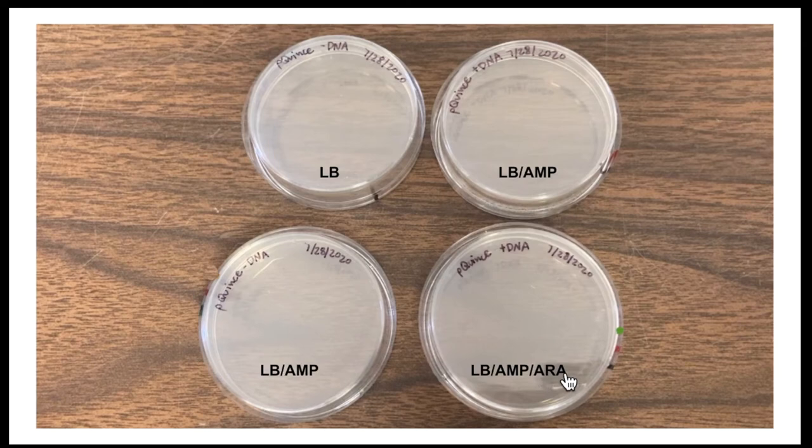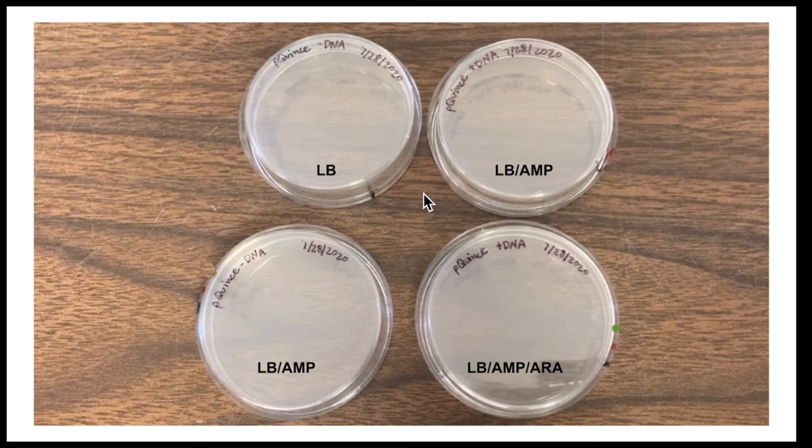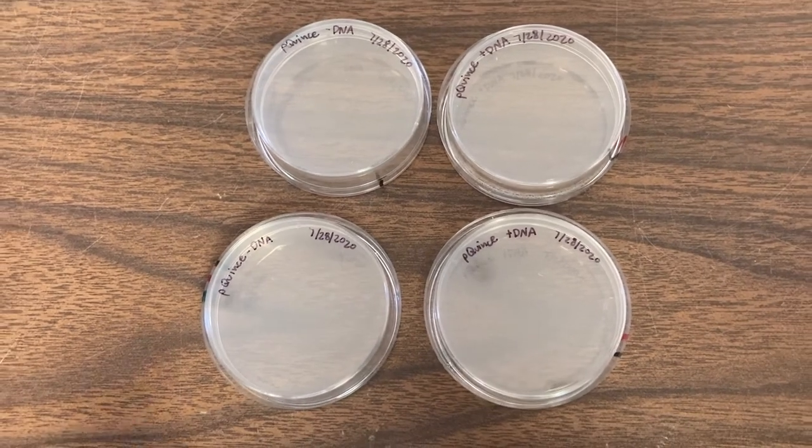And this will be important when you're making sense of your results from this transformation. One final thing I need to point out before we go to the video on plating. You'll notice that this plate is labeled with minus DNA. That means it will get the bacteria that did not receive the plasmid. This plate also will receive the same bacteria, the bacteria that did not get the plasmid DNA. These two plates here are labeled with plus DNA. Here we're going to plate the bacteria that did receive the plasmid. As well as in this plate here, we'll also get the bacteria that did receive the plasmid. That's really important to keep in mind when you go to your results later. Okay, so let's get to the plating.